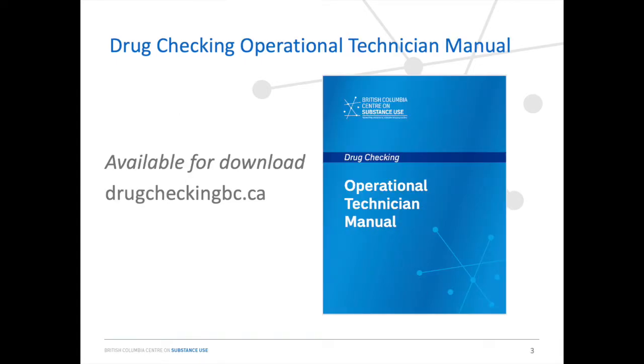All of the steps that I will outline in this video are written in the Operational Technician Manual. It will be your go-to resource for all things spectrometer and OPUS related. To download the manual, visit our website at drugcheckingbc.ca.